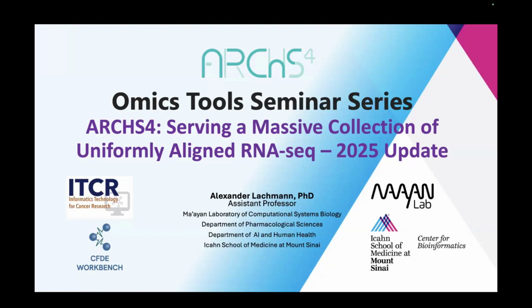And the other thing that is really happening with the ARCHS4 data is the ability to use those embeddings of genes in the space of all of those thousands and thousands of studies. And this really sets apart this data set in biology for gene discovery and gene function discovery and many other applications of AI, and some very exciting developments in this field that this resource is enabling. So Alex, take it away.